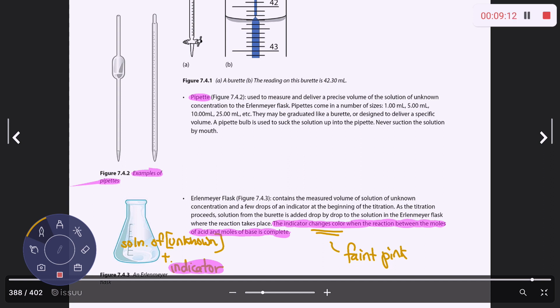So once you start getting close, that's what happens. And you get to a point where if you let a drop hang from the burette and you don't let it fall, but you touch that drop to the side of the flask, that's actually considered a half drop. You could actually change the color of this solution to pink by just letting a half drop fall in, okay? If you go to hot pink, that means you went a little too far. Your solution's a little too basic.